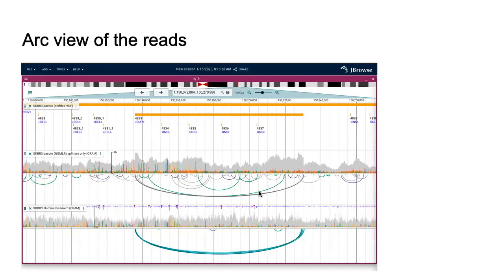I'm definitely really happy with that. The long reads actually look like there's a bunch of spurious arcs in that. I can't really explain that. It might be because the PacBio is a little noisy. It's not HiFi. So that was an overview of structural variant features.